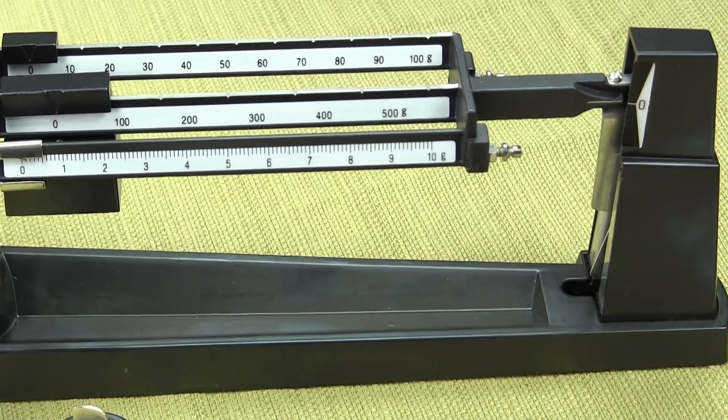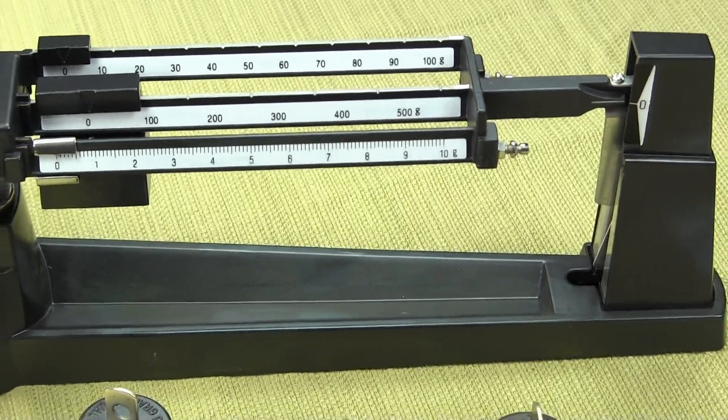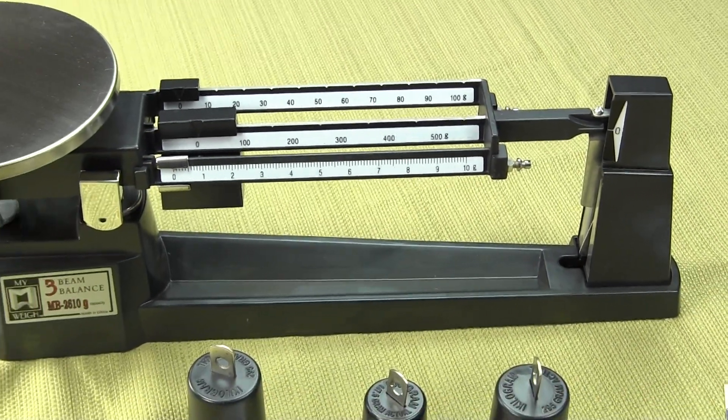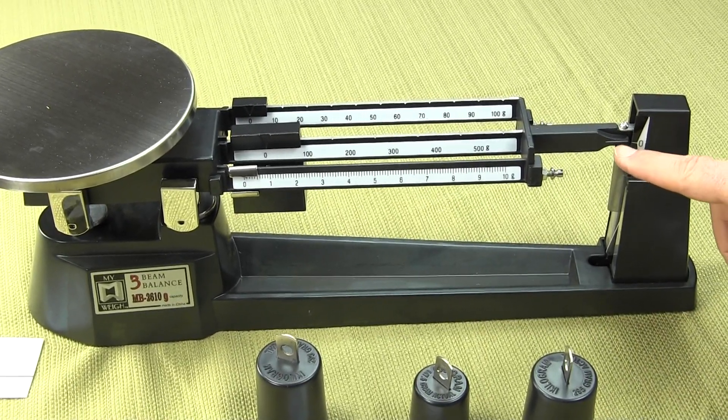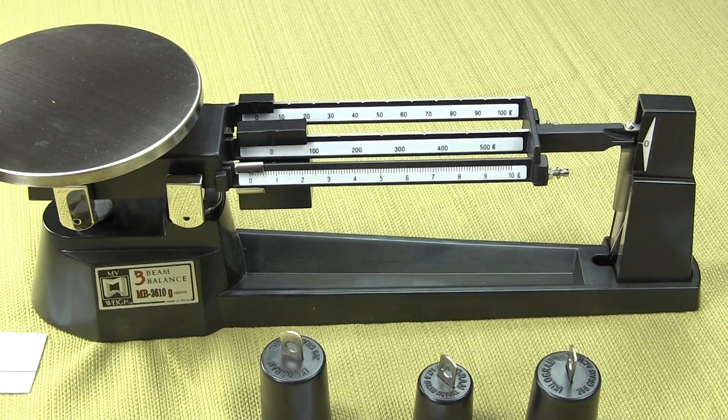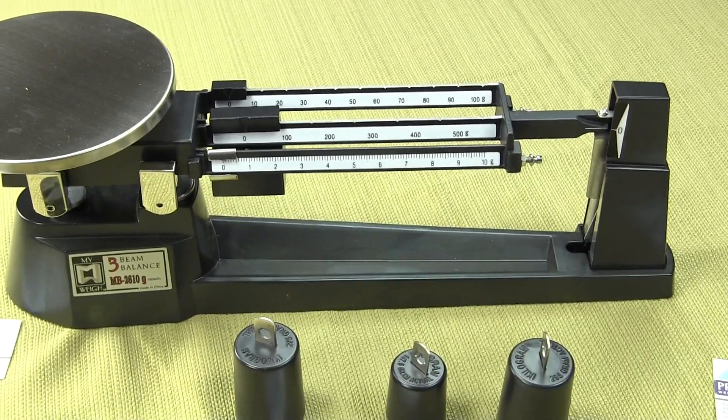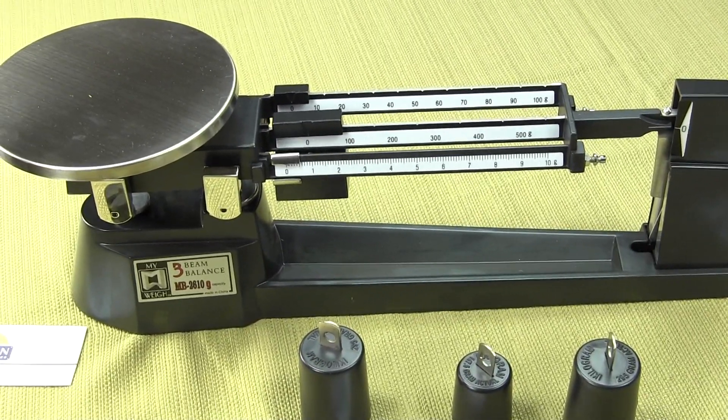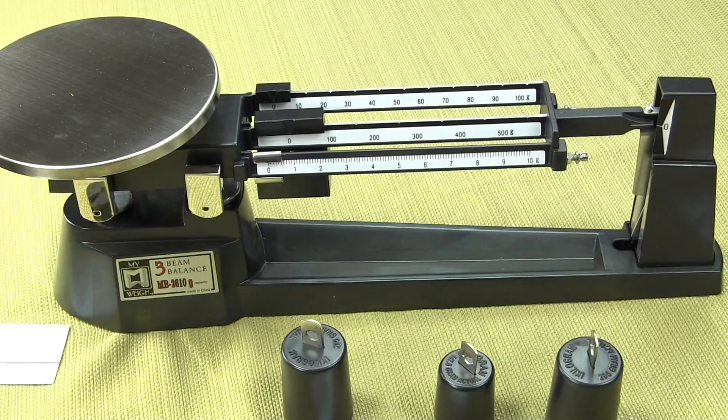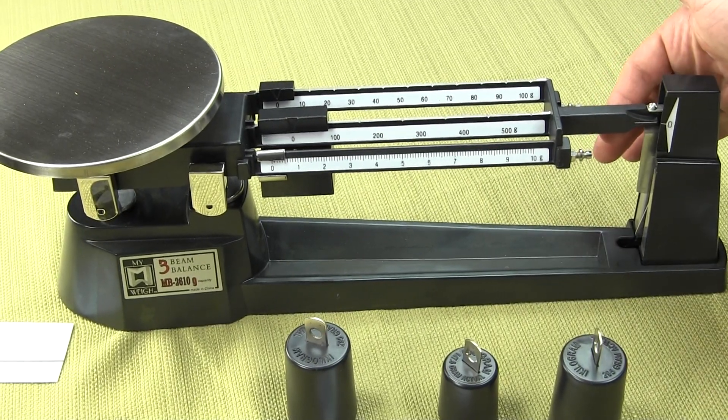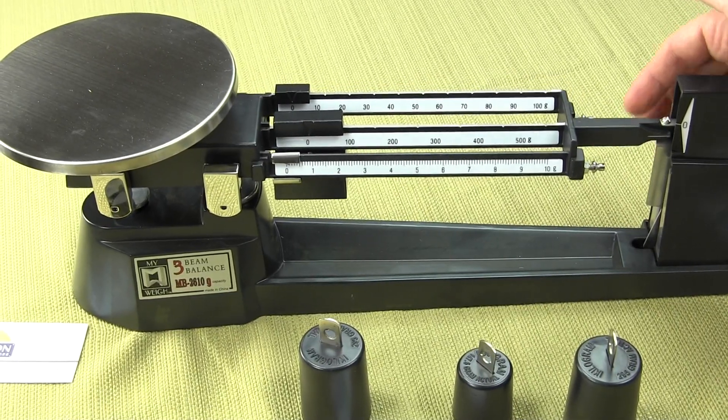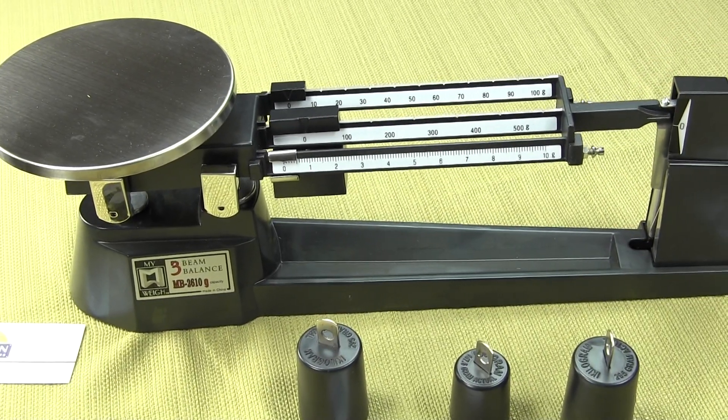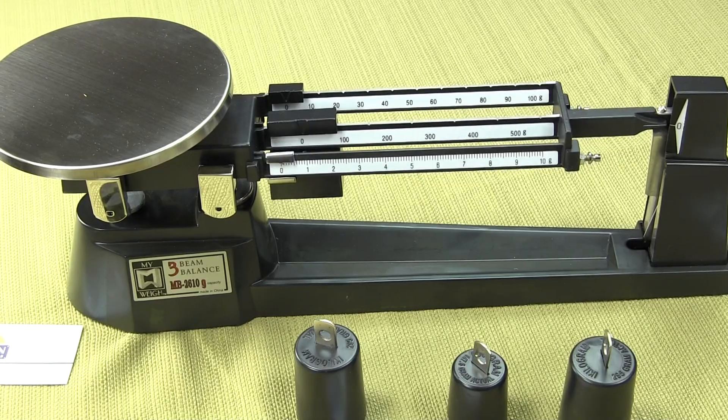That's how you use the adjustment curl knob to balance the three beam balance. The hashtag at the very end here is lined up with a hashtag that's on the beam. The way that curl knob works is if you turn it clockwise, the arm will end up going up higher. If you turn it counterclockwise, the arm will go lower.